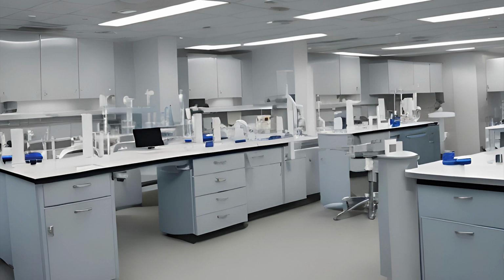When setting up your centrifuge for these samples, keep in mind that this is a piece of equipment that is going to spin very, very fast. The rotor, the part of the centrifuge that holds your tubes and spins, is located in a sealed chamber in the middle of the centrifuge, and typically will not be able to be opened while it is moving.